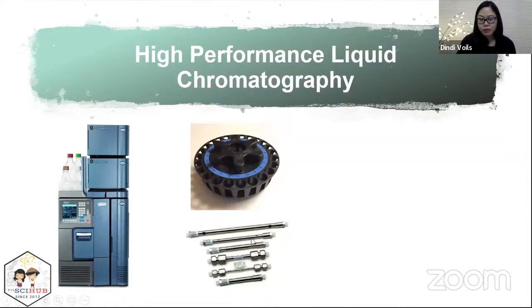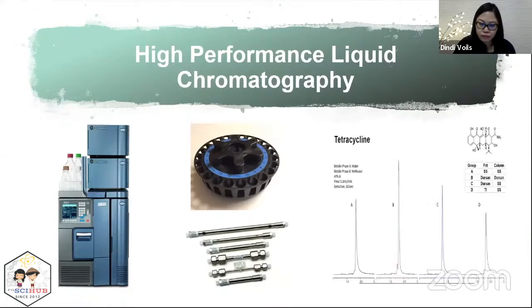In an HPLC system, sometimes you use what's called a guard column to protect your HPLC column from any contaminants, because HPLC columns are actually very expensive, whereas guard columns are relatively cheaper. If you use this as your filter, then the entire technique becomes more cost efficient.